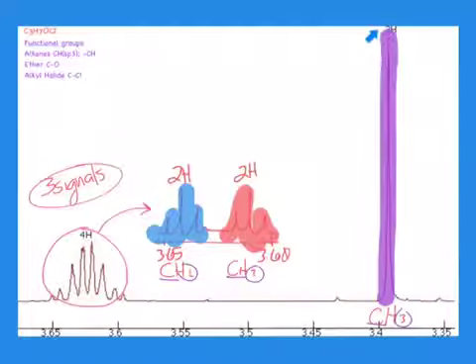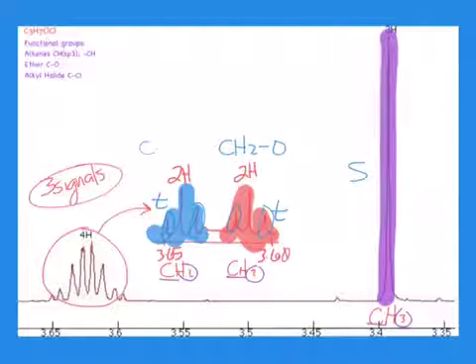Splitting shows that this peak is a singlet because it has one giant peak and no neighbors. A closer look here reveals 2 triplets because each one has 3 peaks total and therefore 2 neighbors apiece. When referring to the chemical shift chart from before, a 3.3 to 3.9 typically gives a CH2 oxygen bond, and a 3.6 to 3.8 gives a CH2 chlorine bond. This makes sense because when a group is attached to an electronegative atom, the chemical shift increases.